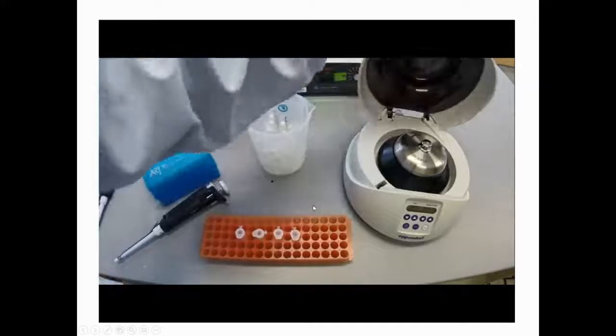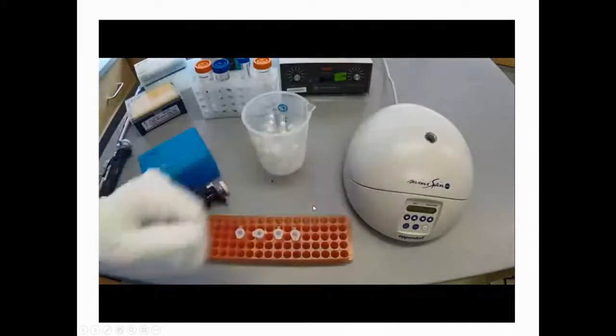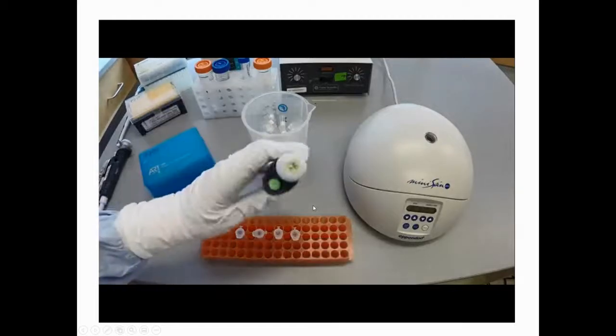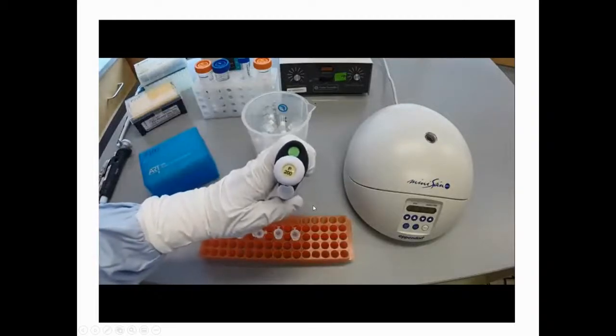In this step, the pellet still contains the DNA, and it is important to remove as much supernatant as possible without disturbing the pellet. So remove and discard the supernatant using the P200 for precision.